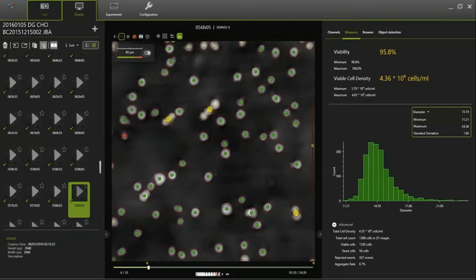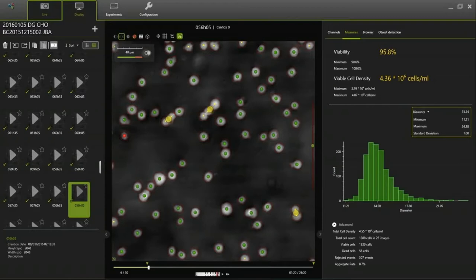Here is an example screenshot of the most basic setup, looking at cell count and viability. On the left side of the screen you see all the individual data points during a run. We can present a data point every 30 minutes, but that can also be every hour, two hours, or three hours — whatever is preferred. Every 30 minutes is the maximum frequency. The green dots indicate viable cells, red dots indicate dead cells, and yellow dots indicate aggregates.